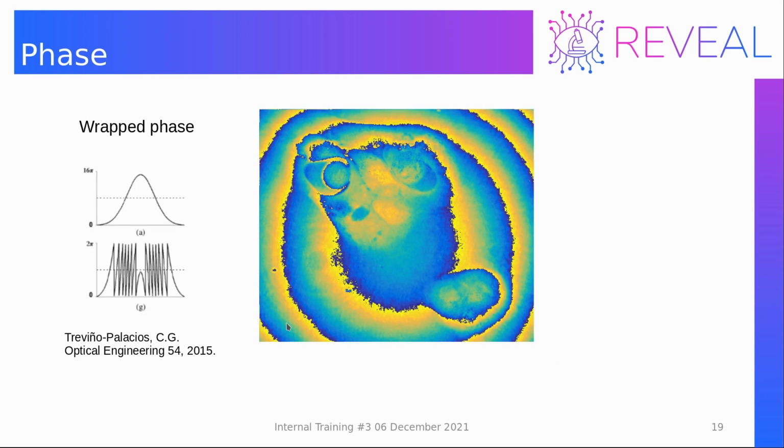So this is the result of the inverse Fourier transform. If I now would click and show you the values of pixels in this image, then these values would already carry information about the phase of light that went through the sample. However, you can immediately see that there is something wrong with this image.